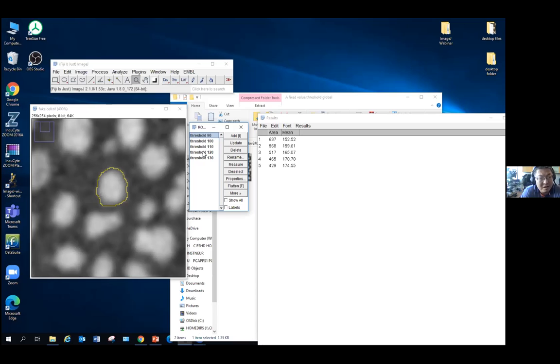A single image doesn't mean anything. I always feel this way. You have to apply it to multiple images to get the statistics to say whether the difference you see is real or not.